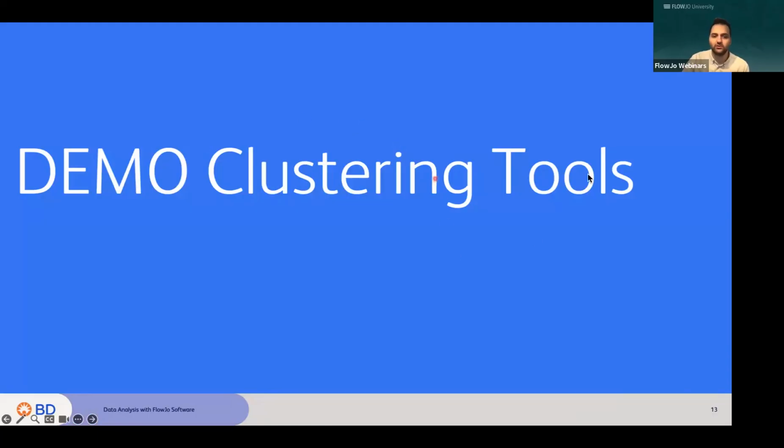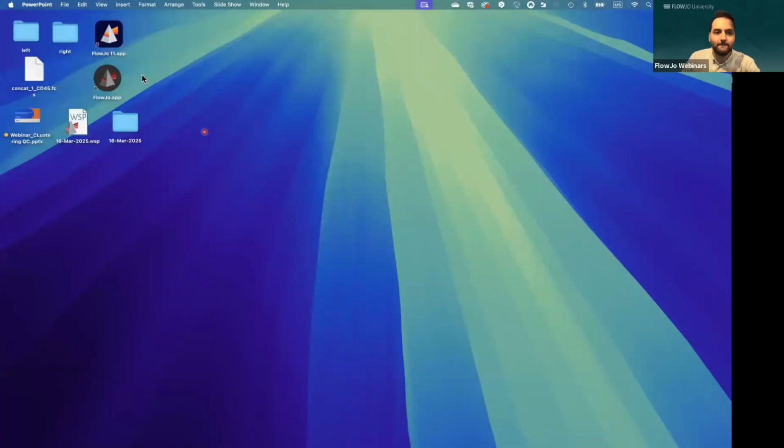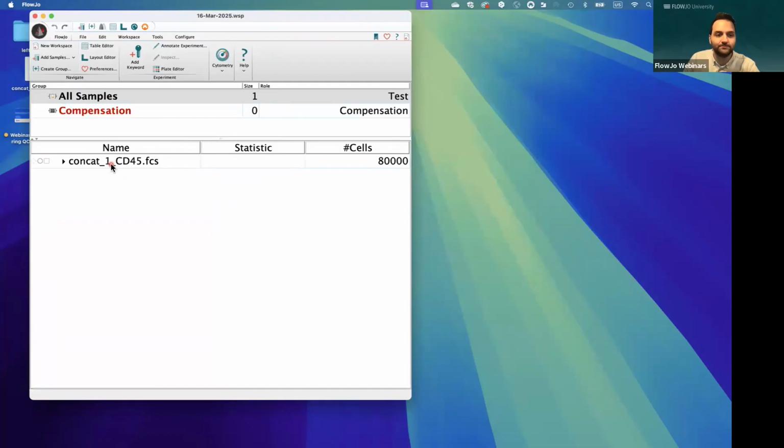Right, so why don't we get into a bit of a demo in FlowSOM and see how all those tools work out. I will just quit the presentation here. Okay. I will open a workspace that I have. Okay, so again, I have a concatenated file here. I concatenated wild type and knockout mice after I gated on CD45 positive.